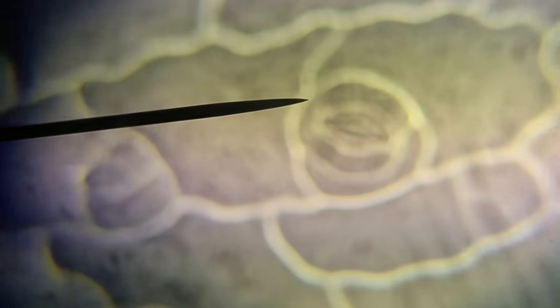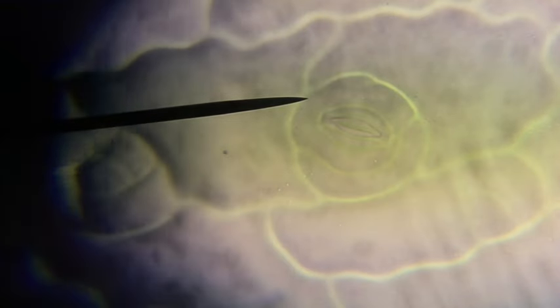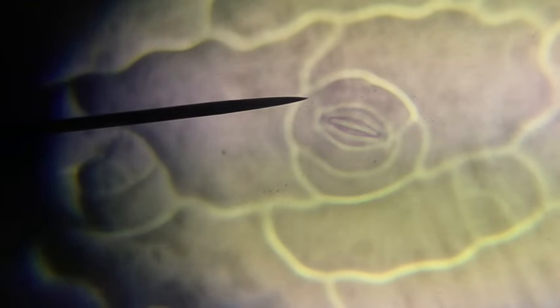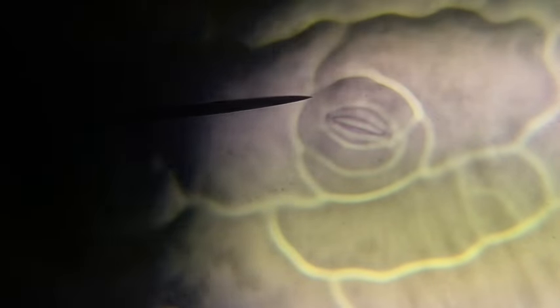So some different things you could do is you could see if any of them are open or if they're all closed. This one appears to be closed. You could give maybe a count and see how many there are on the underside of the leaf versus the top of the leaf, or compare and contrast two different leaves in terms of the number of stoma or stomata.